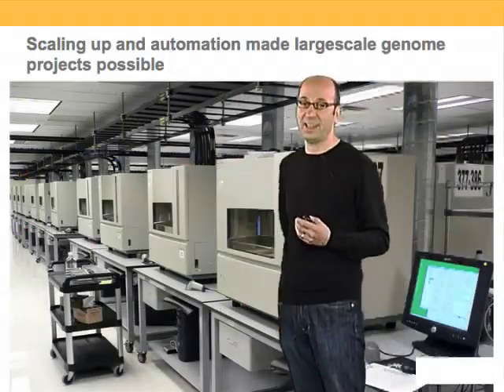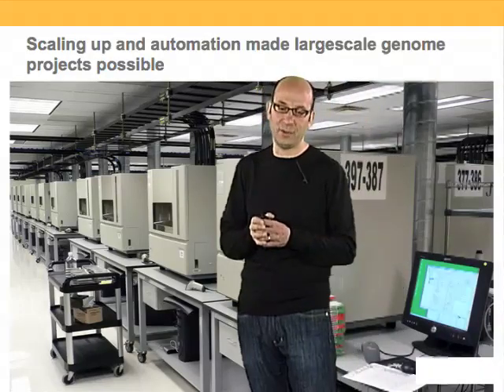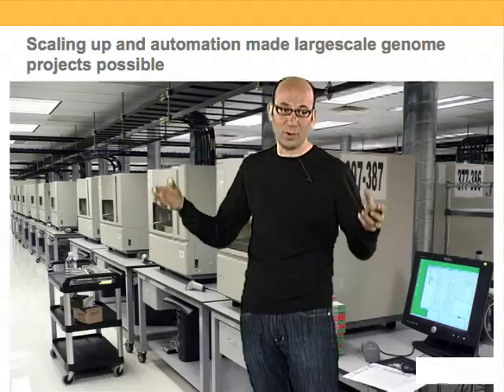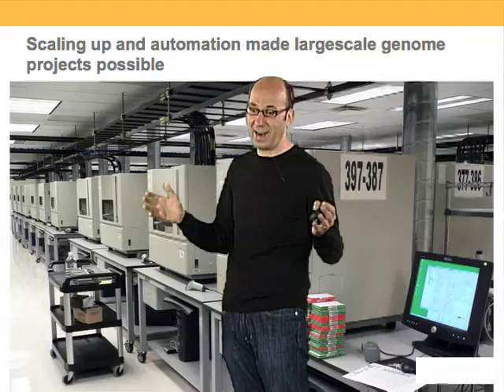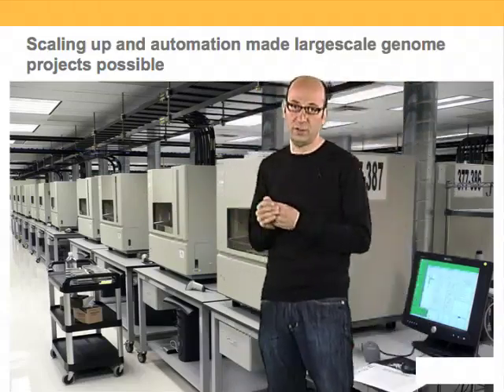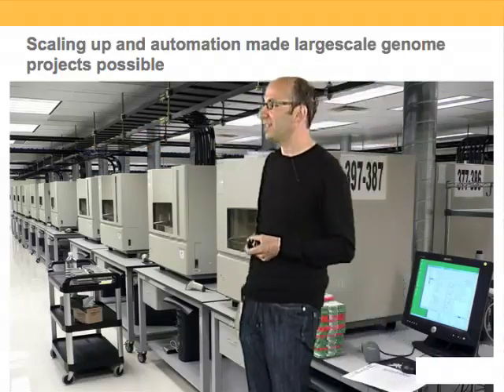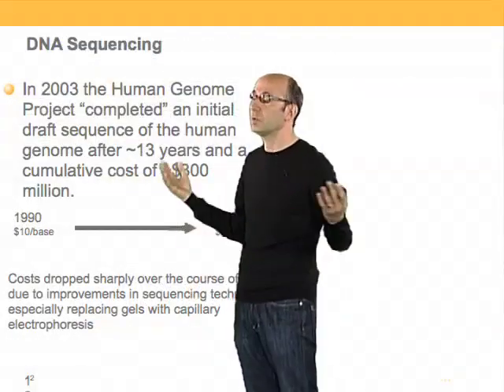Basically, it was by scaling up. So as you may know, when you want to make a vaccine for influenza, the approach is you take an egg, you put in influenza, and you grow more influenza. And then you take that and infect more and more eggs. And the way we get the H1N1 vaccine is to take warehouses with millions of eggs and just scale everything up. And that's essentially the strategy that was used for the human genome. You would get a factory like this filled with boxes that would run 24/7 and have a computer support and technicians keeping these going.